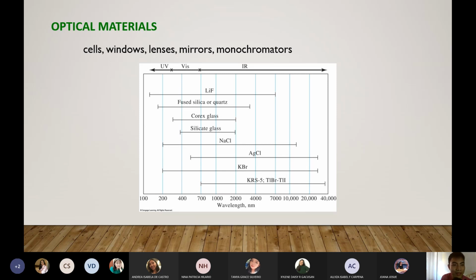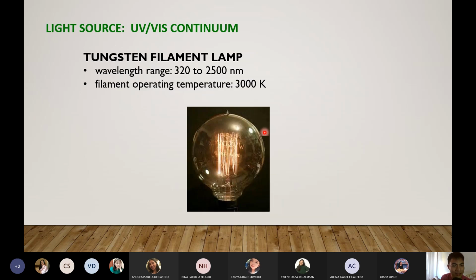Okay? Kaya pag nasa chem lab kayo or magke-chem lab din naman kayo pag nag-work kayo, no? Ma-encounter nyo rin yung mga instrument na yan, no? So you really have to be careful, no? Especially kapag quartz glass yan. That is very expensive, no? Super mahal niyan. 5 digits yan. Mas malaki pa sa sweldo natin.